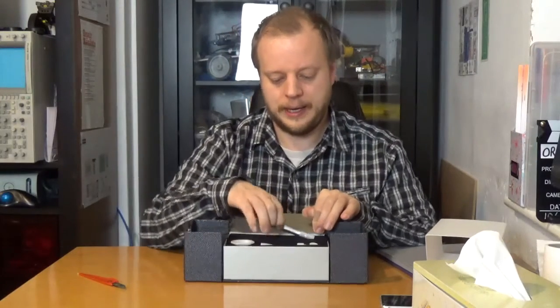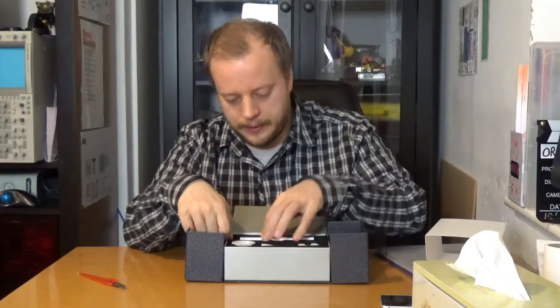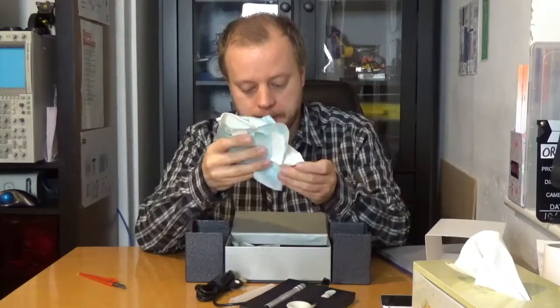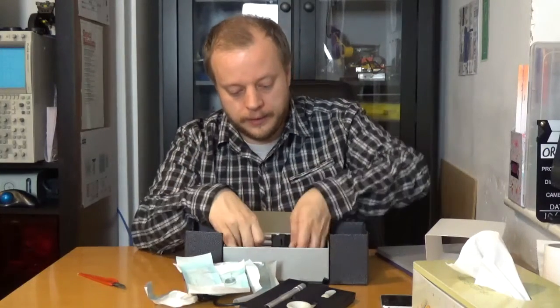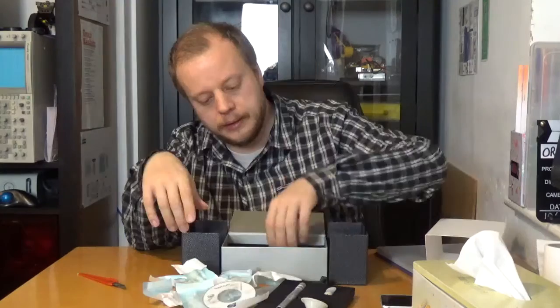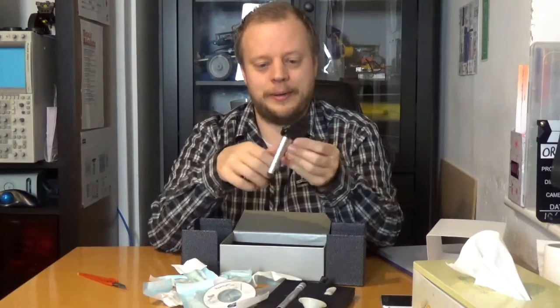Here is the actual scope, which is a wand type scope. There are tips and adapters, and there is a disc with a little tiny calibration strip on there. And it's got the cutest tiniest little tripod I've ever seen.